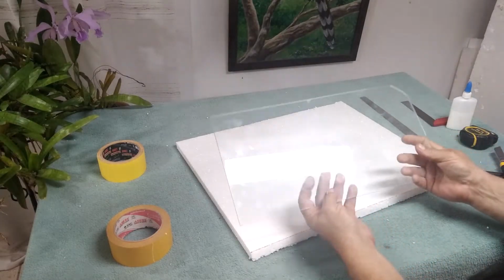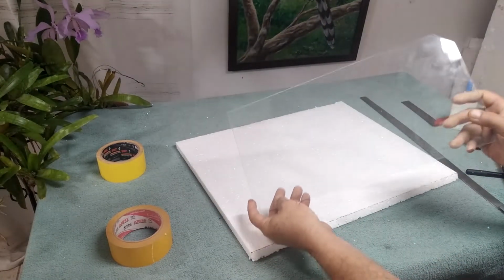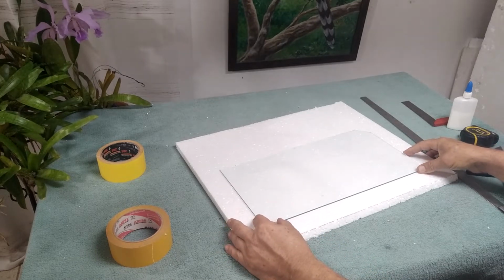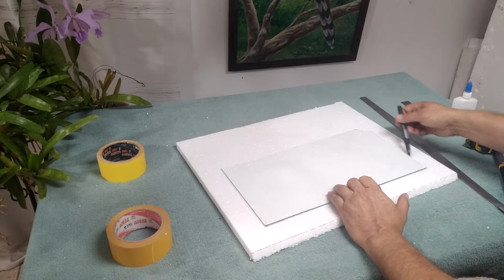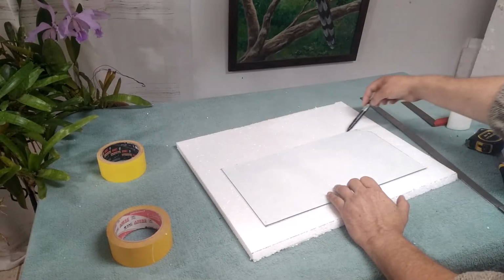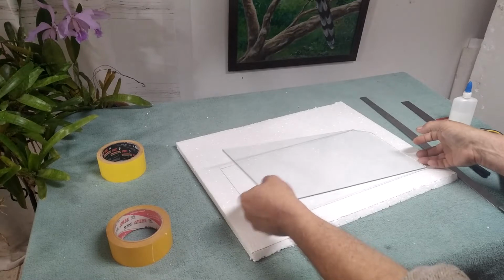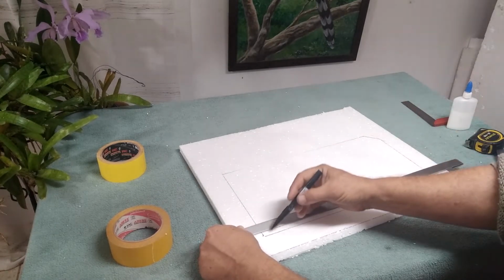We also need a piece of sheet glass. I have this one that used to belong to a fish tank for a lid, but the tank is broken and this is finding a new purpose now. It's not an expensive item though if you have to buy one. You don't want it to be too small so you can comfortably see what you're doing. The best position for the window is like this, centered on the lower half.